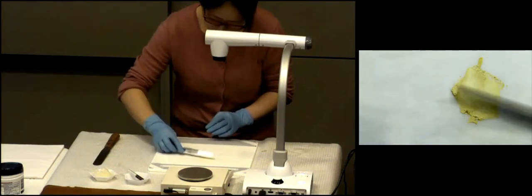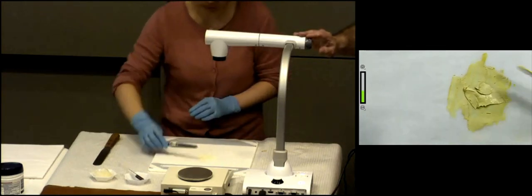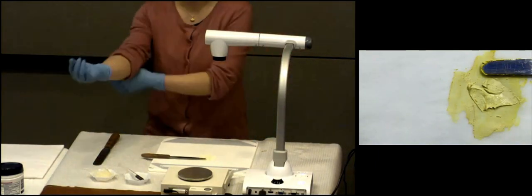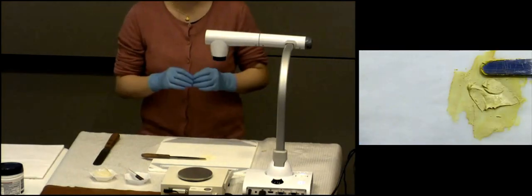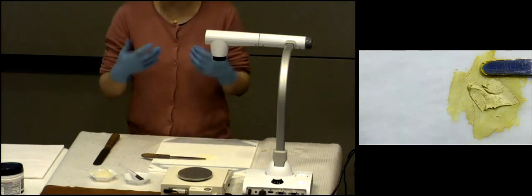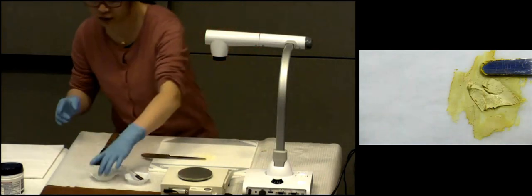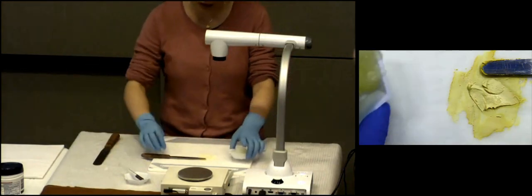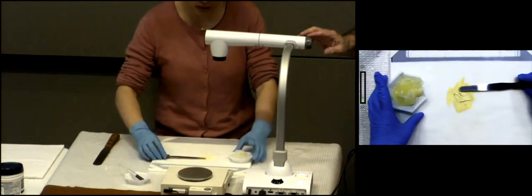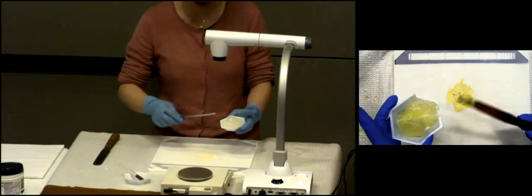That's when you're done levigating, when you've added enough liquid that it is both shiny because of the liquid part to it, and sticky because the liquid holds on to it, and it's not so thin that it runs everywhere. All right, so I have made mine. Did you guys see the reflection of light? It's a little shiny on the top, right? I have made a paste. It's not looking like a puddle, but it's not too thick, somewhere between thick and too loose. So I made my paste already. That is called, what is the term you need to remember? Levigation.